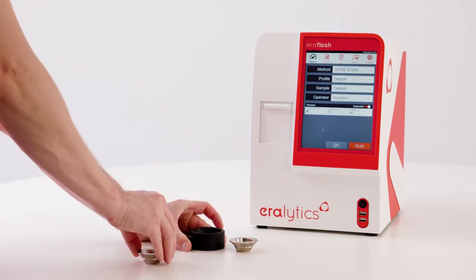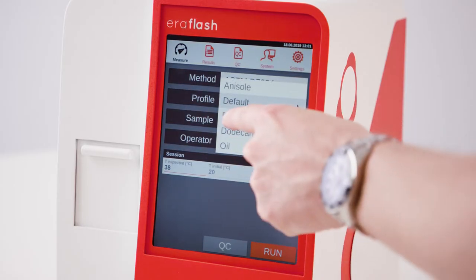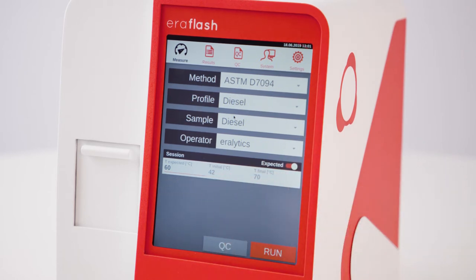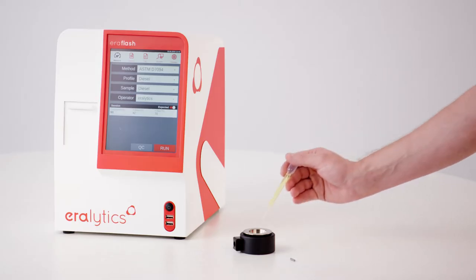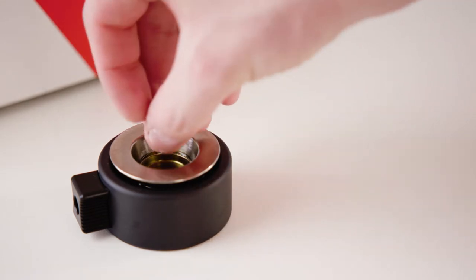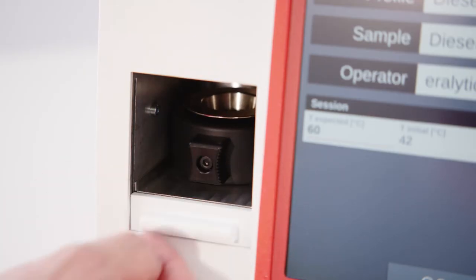The cup carrier allows easy switching between the different cup sizes of 1ml or 2ml. The measurement profiles allow pre-selection of the sample IDs and a measurement range; the profiles can be programmed in detail in the settings menu. Enter or select a sample ID and operator. Use a pipette to fill the sample cup to the mark and add a stirring magnet.